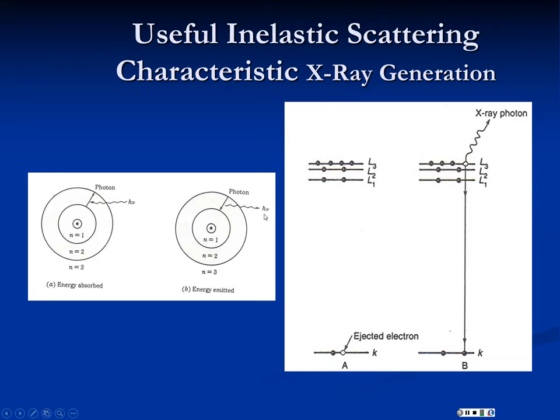The difference is, if you remember from our discussion of structure of atoms, these energy levels are quantized. That is, they're steps. Only certain energy levels exist, which means these photons will have only particular energy levels. They're not continuous like the Bremsstrahlung X-rays are. These are going to only occur at certain levels. So as the electron decays down, fills the inner energy level, it emits a photon that has this energy level.